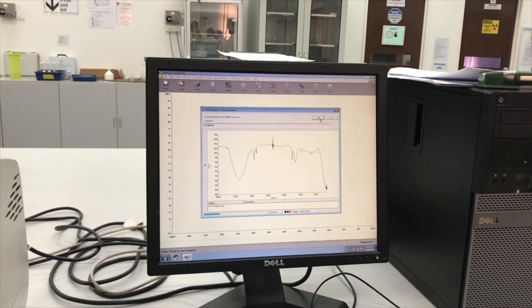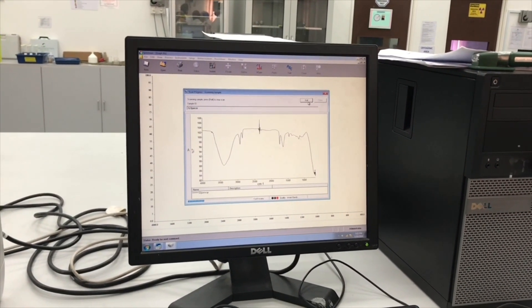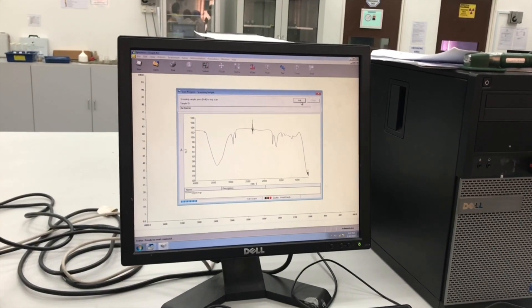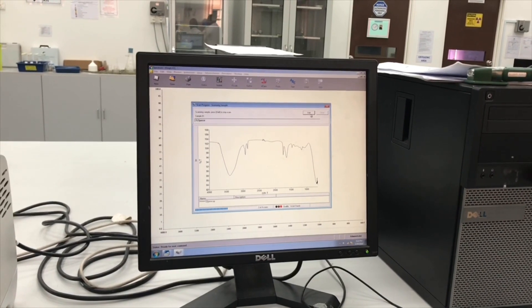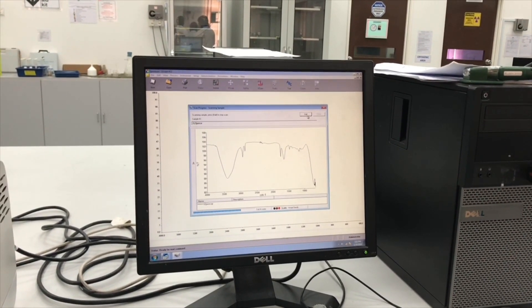After a few seconds, the result will appear on the screen of the computer using the software which measures the sample using the spectra.